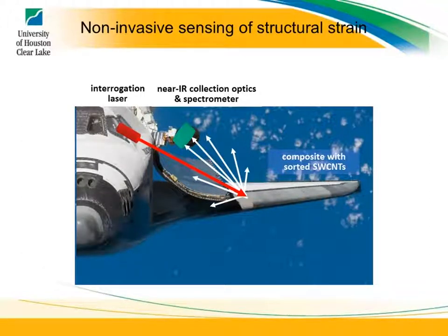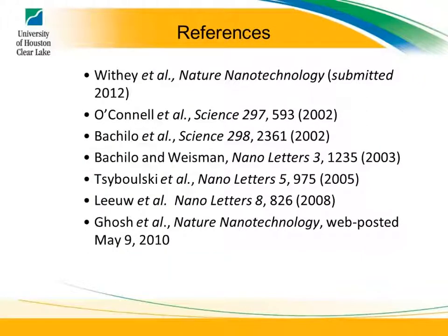Yeah, we've got to work on getting the detection pretty good. I don't know what density of nanotubes you have to have in there, but that may be a little bit grandiose, but you could at least measure wings in wind tunnels and put your detector close to your wing. But this is something that Bruce Wiseman came up with when we first were looking at this, and I thought that was an interesting graphic.